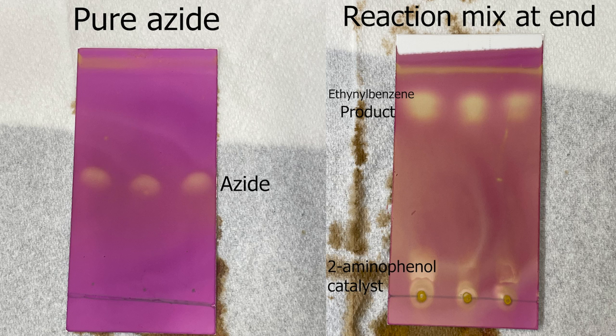On the left we can see the TLC of the pure azide and on the right of the reaction mixture. As we can see, the spot from the azide is no longer seen in the reaction mixture. So it has all been consumed and the reaction is finished.